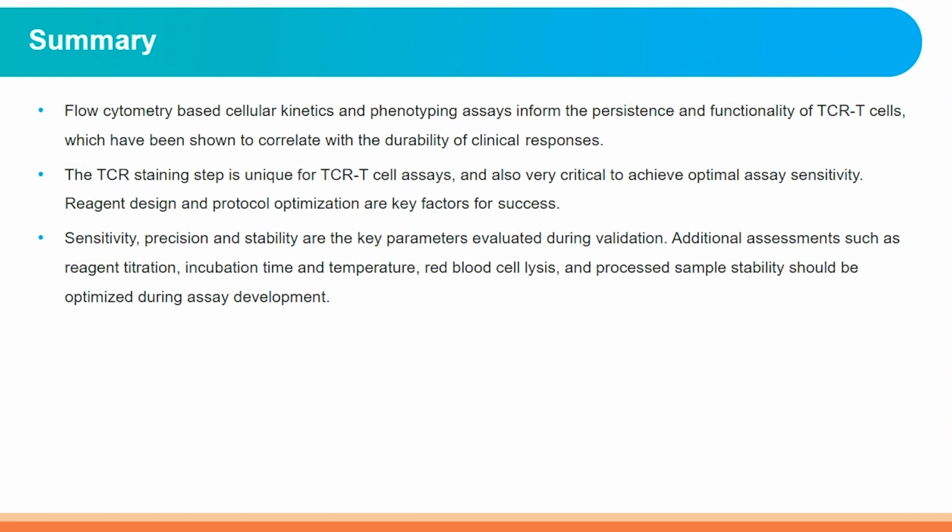Here is a quick summary of my talk today. Flow cytometry-based cellular kinetic and phenotyping assays inform the persistency and functionality of TCR T cells, which has been shown to correlate with durability of clinical responses. The TCR staining step is unique for TCR T cell assays and also very crucial to achieve optimal assay sensitivity. Reagent design and protocol optimization are key factors for success.